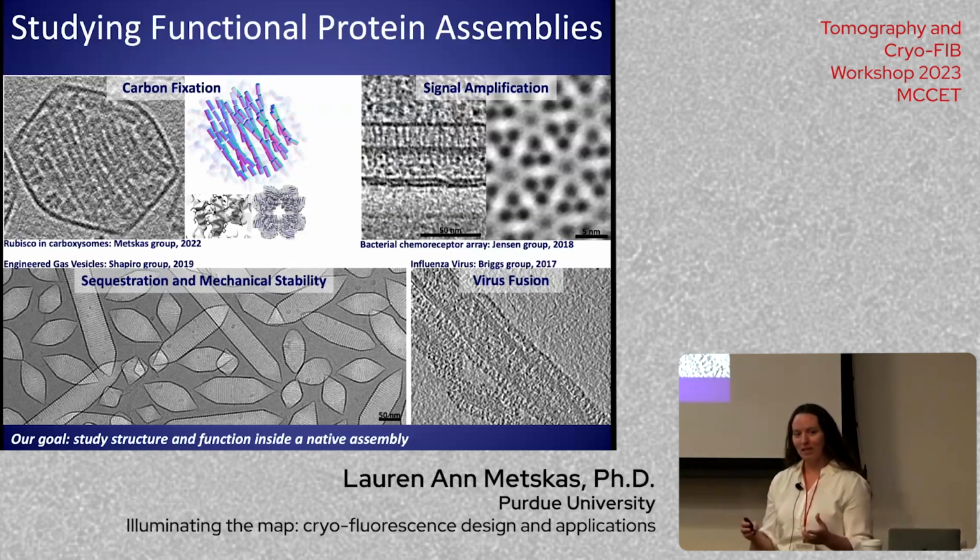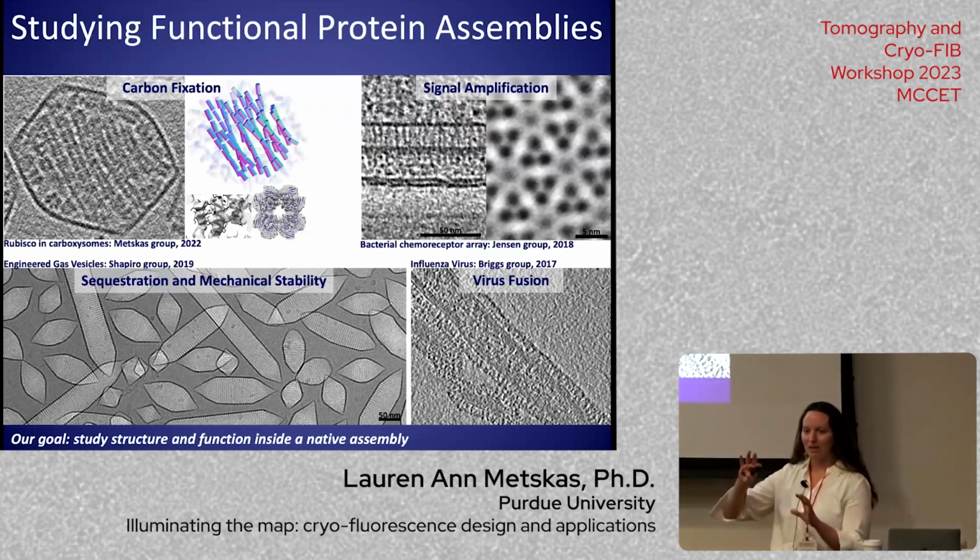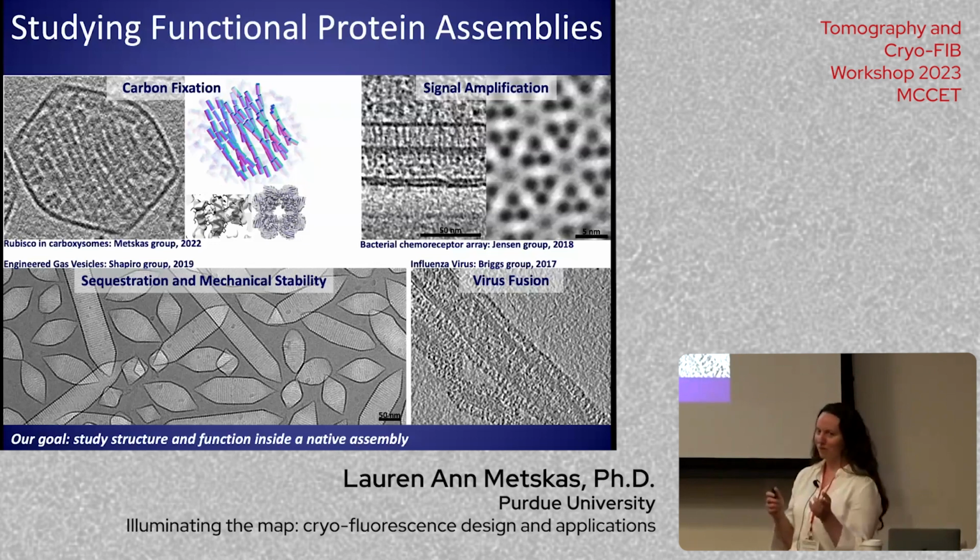And the most important thing is they can always design them really well, but if they're delivering a cargo inside of a cell, they have to fall apart. And that's the hard thing to find sometimes. And so what all of these things have in common is that there is a relationship between the arrangement of the proteins and their function. And so we are trying to always look at both. And this is where the Cryo-CLEM comes in.